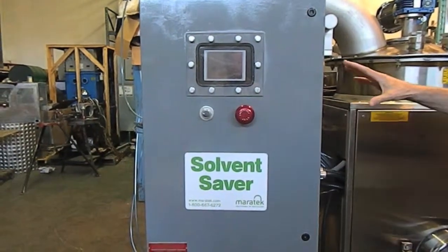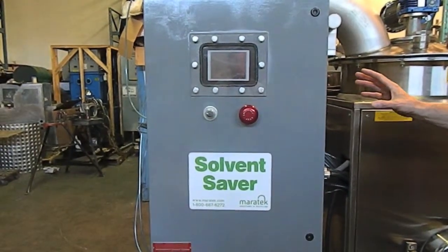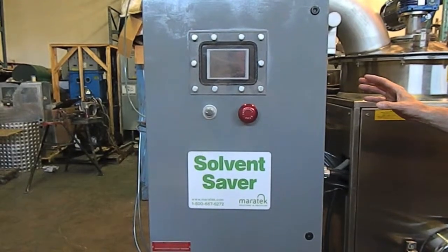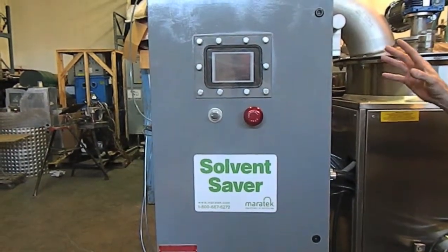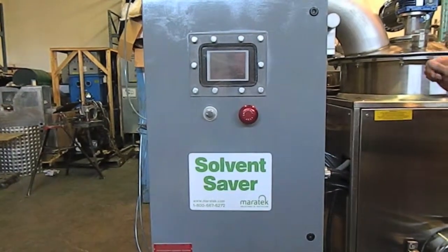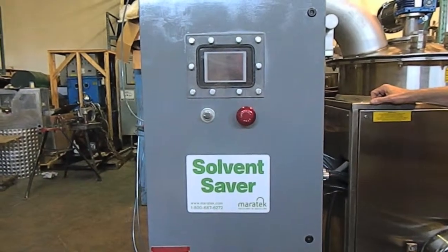What we have here is part of the control system. It has a touchpad PLC system and it's also got Ethernet capability so that we can remotely monitor and support from our head offices in Toronto, Canada.